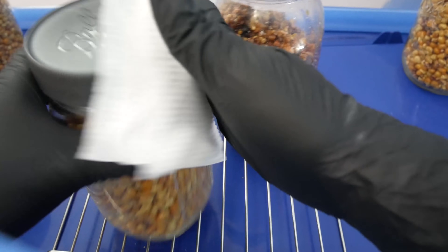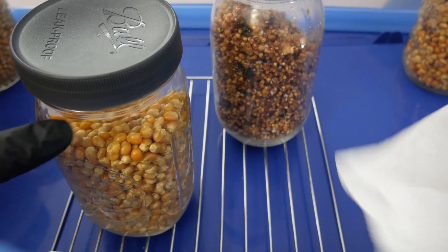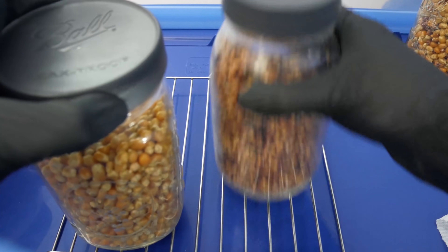Repeat the process for as many jars as you like, and keep going until you've pretty much used up all of your colonized grain jars.